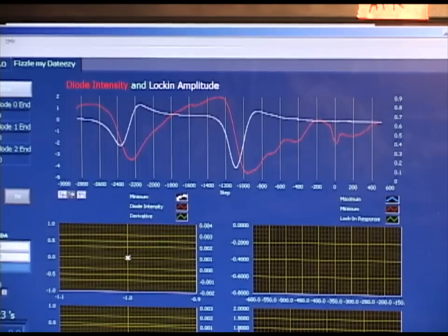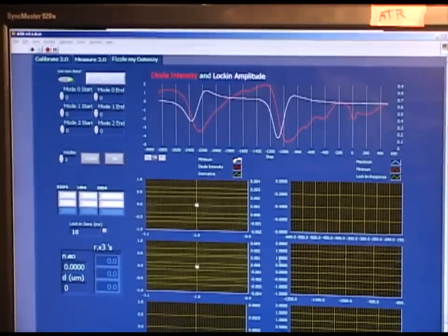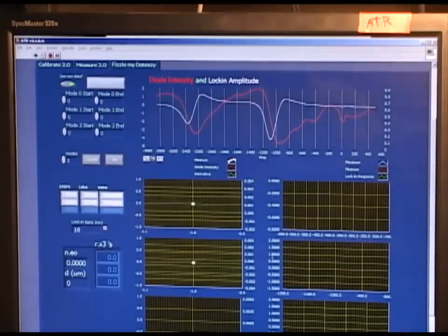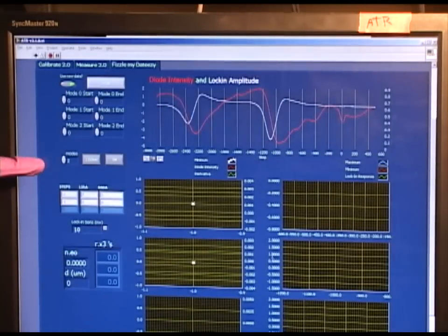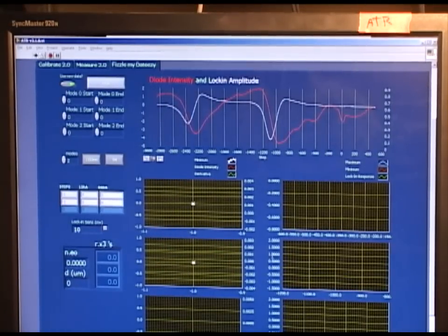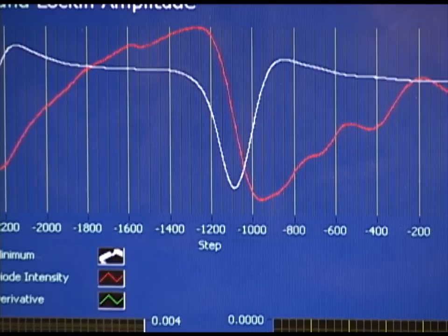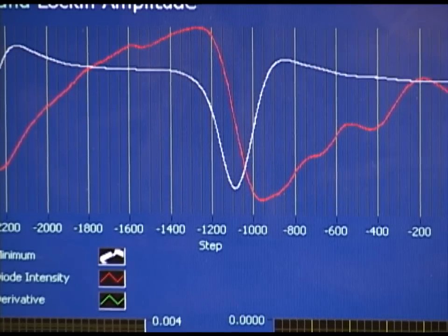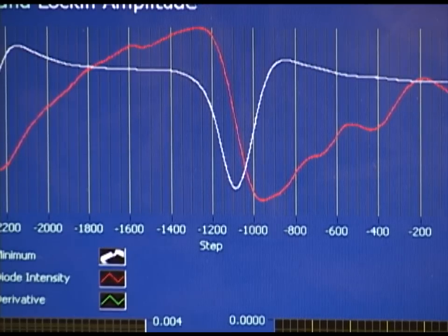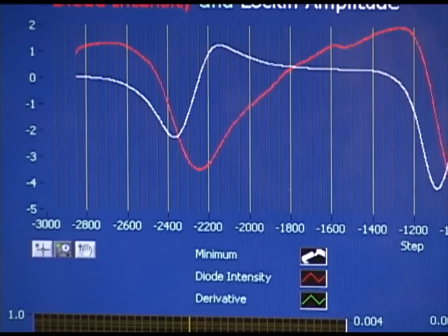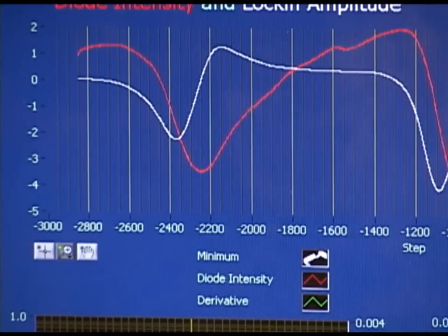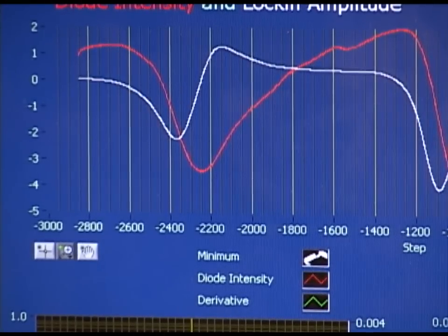To fit the data, we first want to indicate the number of modes present. Here, I see two clear modes, one here and one here. So, I will input that there are two modes. Once we have designated how many modes there are, we want to select the step numbers that correspond to these modes. I will guess a value of negative 1200 steps for the start of mode zero, and the end to be at approximately negative 900 steps. For the second mode here, I will guess the start to be at negative 2600 steps to approximately negative 2200 steps.